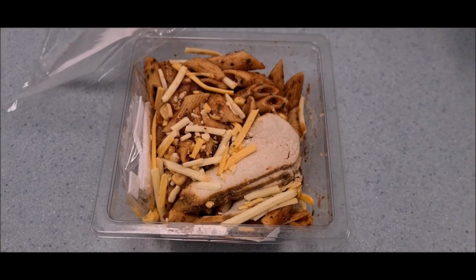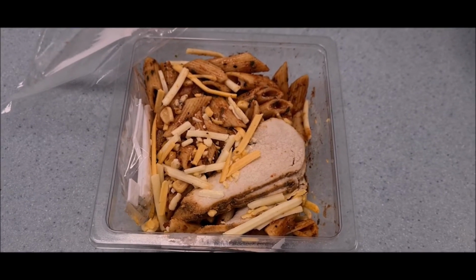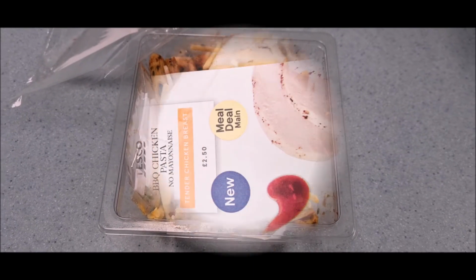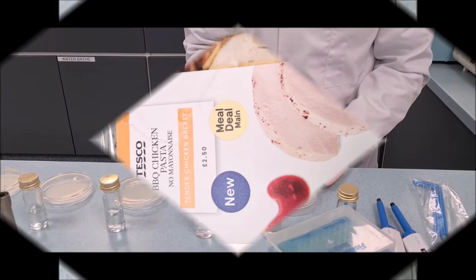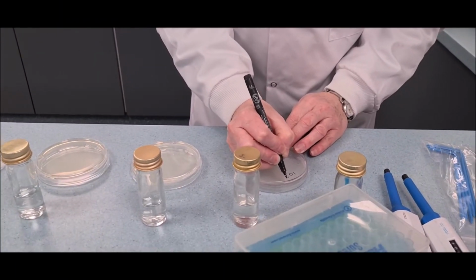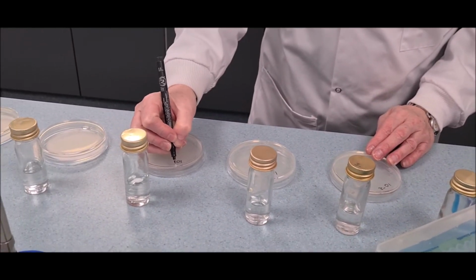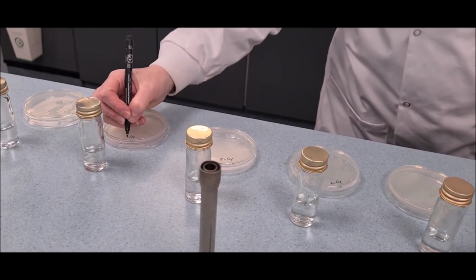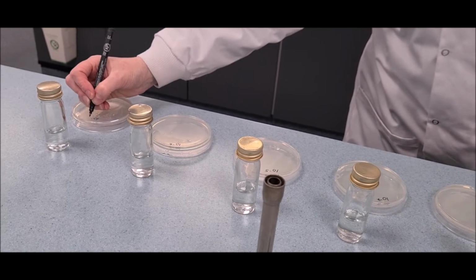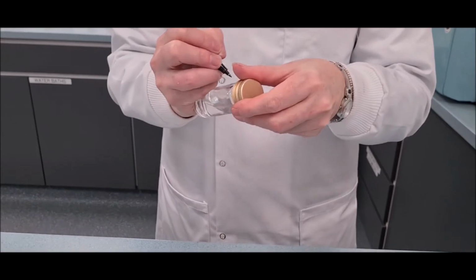Now let's start by sampling the food in which we want to detect and identify microorganisms using the selective and differential media. We will be sampling and microbiologically evaluating barbecue chicken pasta as our food sample. Before sampling the food, you need to label all the dilution bottles with corresponding dilution levels. The agar plates are also labeled on the agar side with dilution levels and ID to identify your samples. In this demonstration, only the dilution levels are shown as labels.